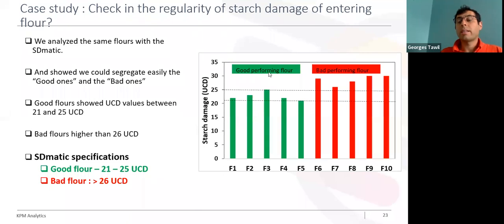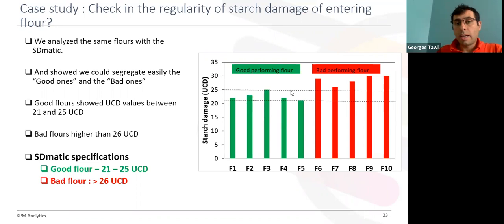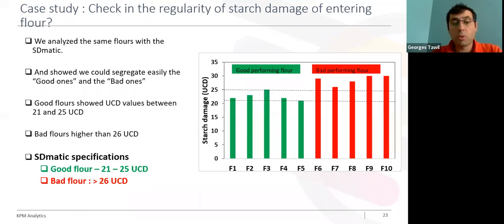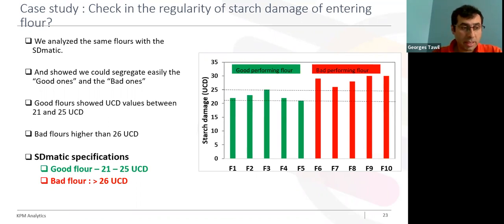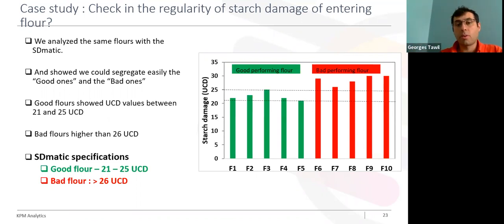We analyzed these 10 flours for starch damage content with the SD-MATIC, and we were easily able to separate the good flour from the bad flour and explain the reason. The good flours had a relatively low amount of starch damage — between 21 to 25 UCD — and the bad flours showed higher content of starch damage, more than 26 UCD. Based on this result, the bakery added SD-MATIC specification to their incoming flour requirements. Today, the miller must determine starch damage for the delivered flour.